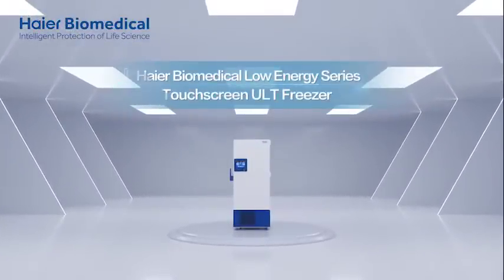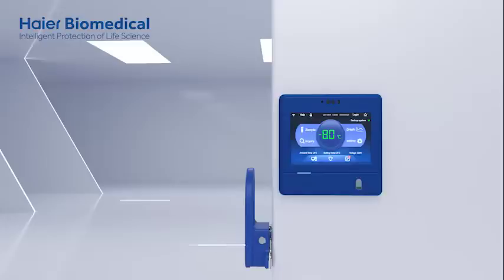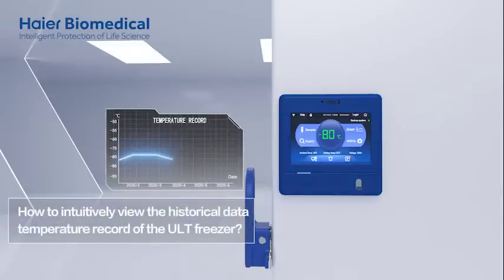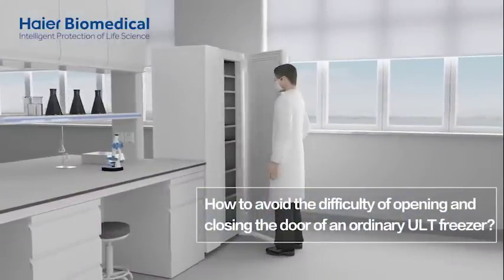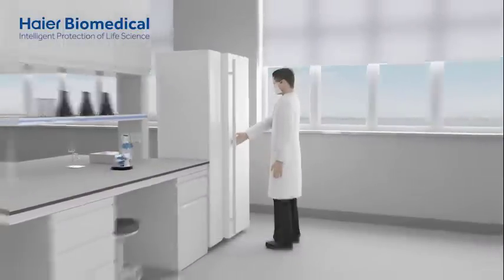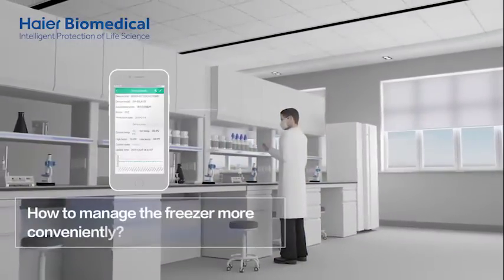HIYAR Biomedical Low Energy Series Touchscreen ULT Freezer. How to intuitively view the historical data temperature record of the ULT freezer? How to avoid the difficulty of opening and closing the door of an ordinary ULT freezer? How to manage the freezer more conveniently?